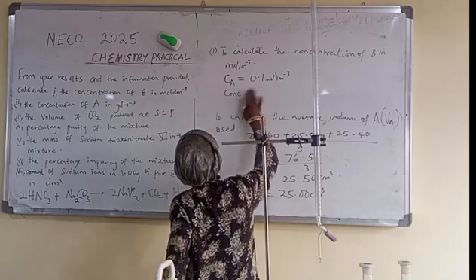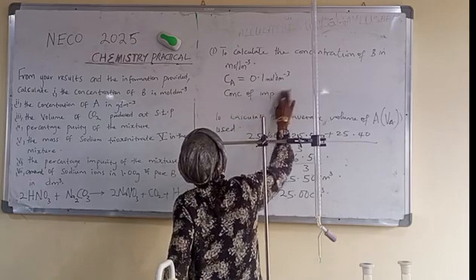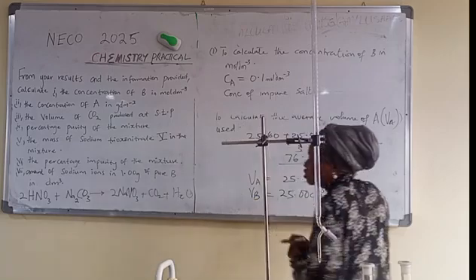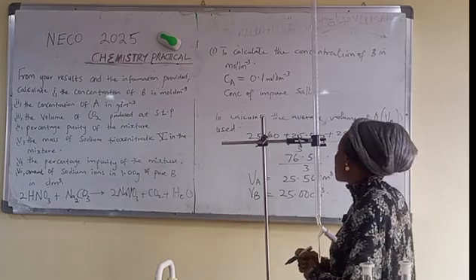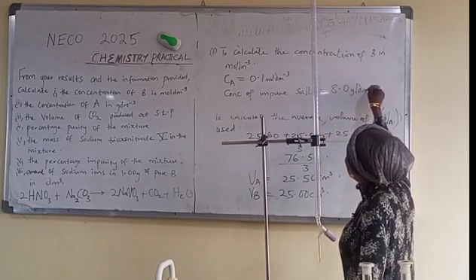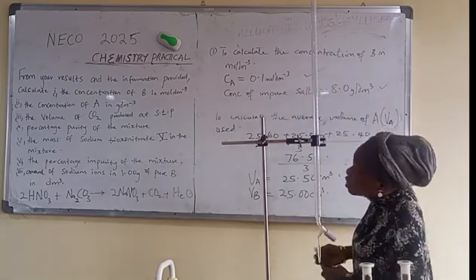Impure, the mixture of the two salts. You know, they mix sodium trioxocarbonate(IV) plus sodium trioxonitrate(V) together. So we have the concentration of impure salt, which is 8.0 gram per dm cube. These are the information provided in the question for us.